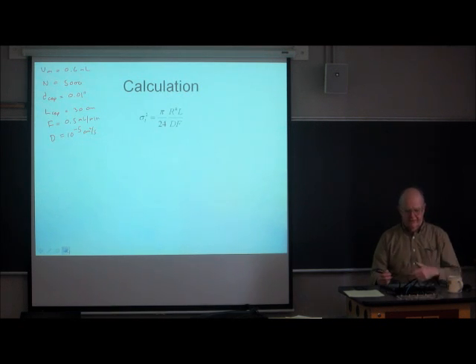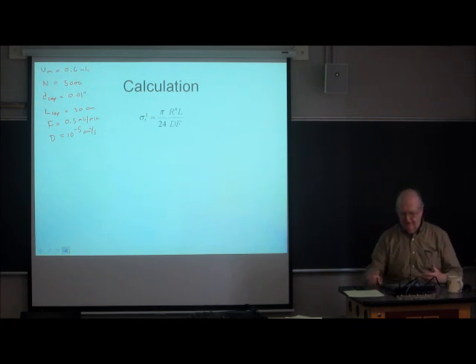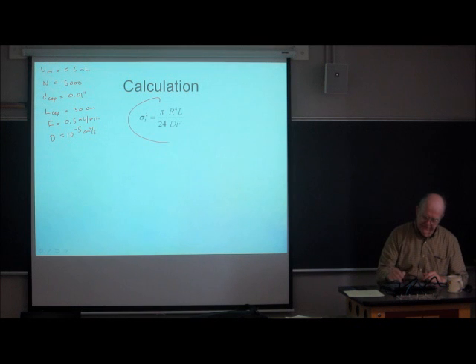So let's put this in the context of HPLC. This is the problem I gave you to work on. I'm going to start by calculating the time-based variance. So this is the variance of the tubing.